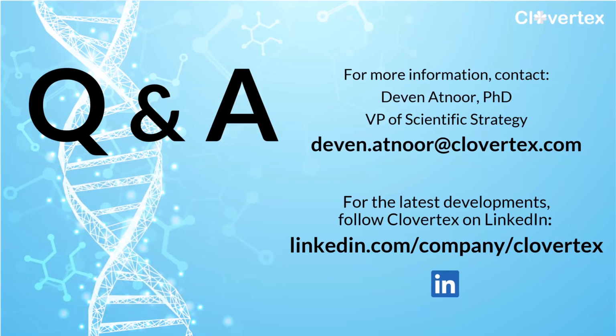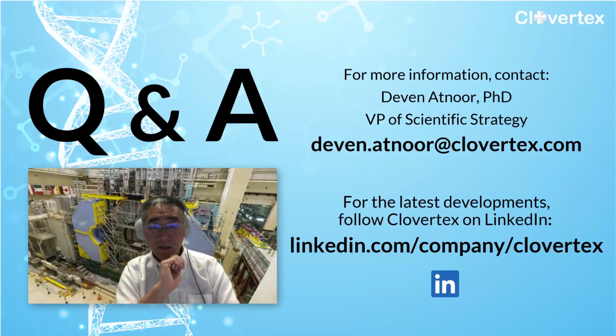Great. We have a couple of questions from Vadim, who says, thank you for sharing your experience. Regarding compound screening, what is the typical number of micrographs that you need to get good resolution of the ligand? Given the cost of running cryo-EM, even with all optimization, I think checking more than 10 compounds is prohibitively expensive. Yeah, I totally agree with you. This is an ongoing effort for us too.